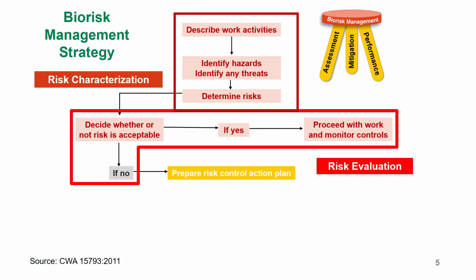So you need to prepare, or you need to decide as a laboratory to say, okay, we can reduce this risk, and these are the controls that we think can work to reduce this risk. So you prepare a risk action plan. But then most of the time, your risk action plan will have a lot of possible risk control measures that can either reduce or eliminate your risk.